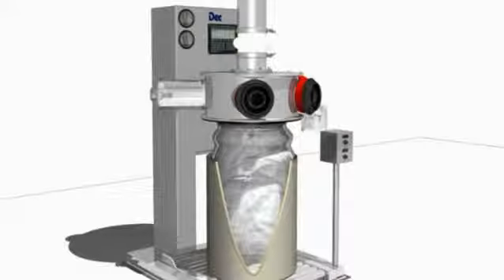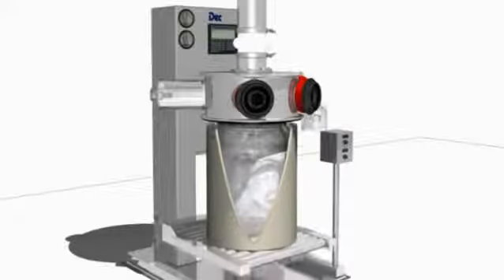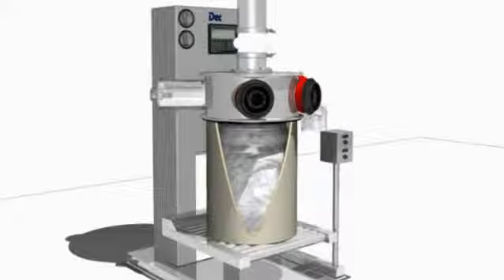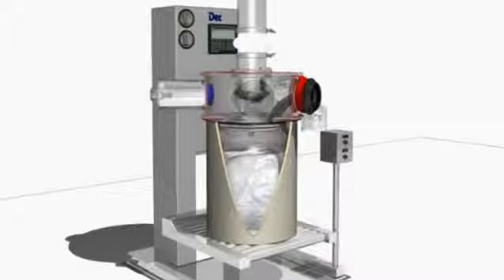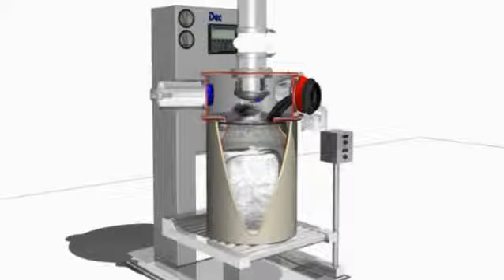The system has a small round isolator that is a key access point for the operator. Once the lid is removed from the drum, the drum can be transferred into the DCS. The operator then presses the integrated safety switches and lowers the isolator onto the drum.